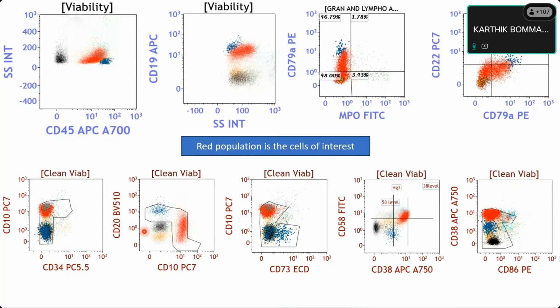Positive, yeah. And CD20? CD20 is dim positive. Heterogeneous positivity, right? So negative to moderate. Sorry, negative to dim expression, heterogeneous. Okay. And CD58 is nicely positive. So what is your diagnosis?